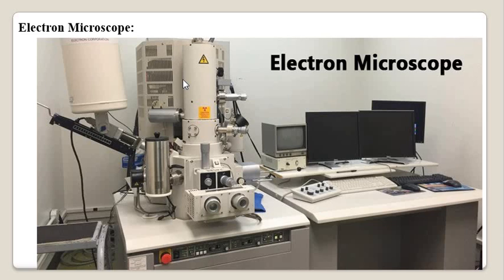In a light microscope, the image can be seen with the eyes or on photographic film, but in the electron microscope, it can be seen on a fluorescent screen or recorded on photographic film. In a light microscope, the principles of fixation, staining, embedding and mounting are basically similar, but in the electron microscope, the procedure is different.